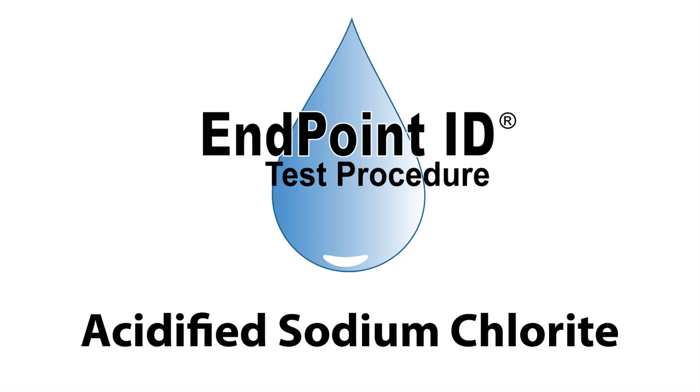This is a demonstration of the Acidified Sodium Chlorite Drop Count Test Kit using Endpoint ID procedures.